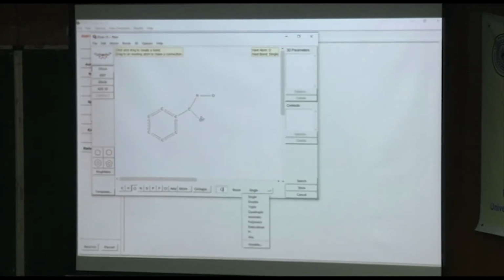I suspected that this was a double bond because it was 1.27 angstroms long, so again, I'm sure it's delocalized, so these other ones aren't necessarily only single bonds. Oh, and there also is one more carbon here, which is actually a methyl group.